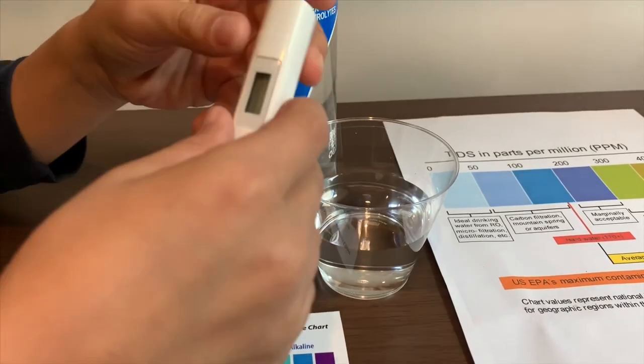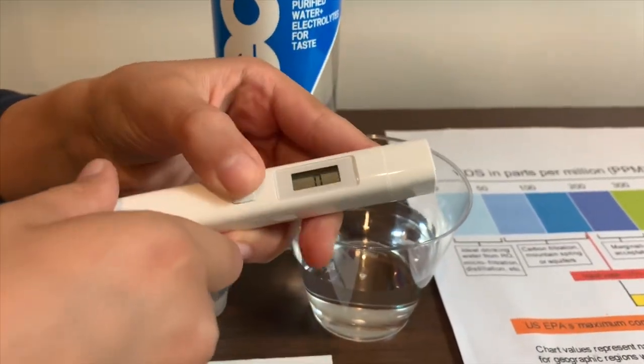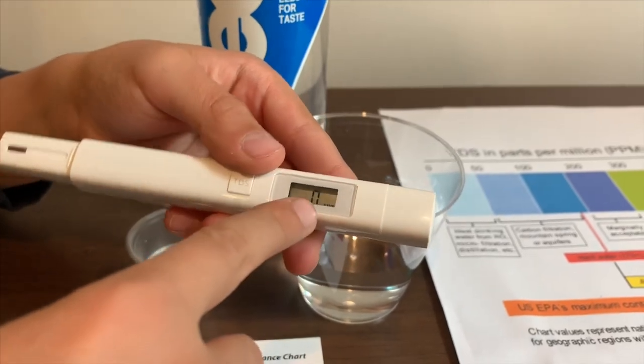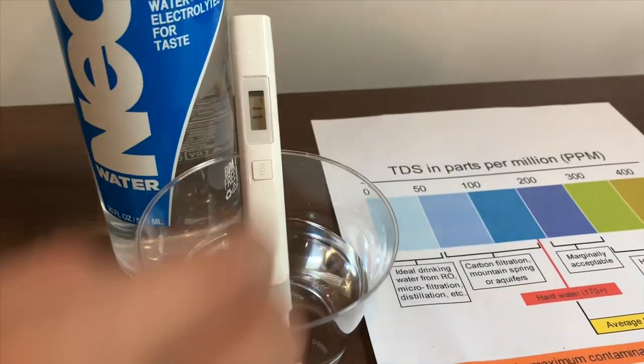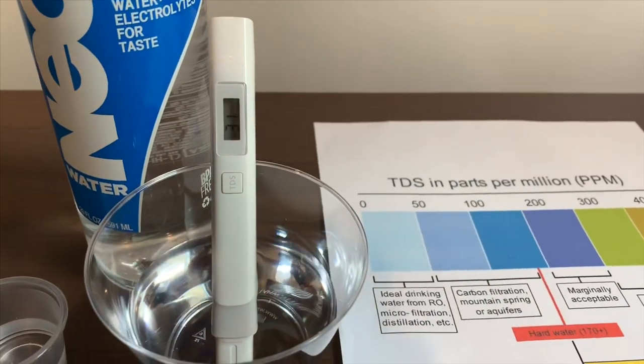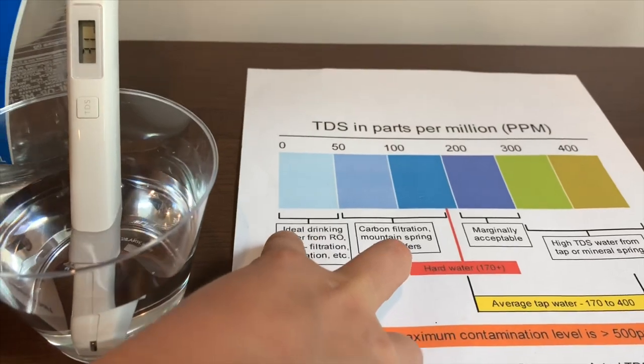If you want to buy this TDS tester, the link is down below. Turn on the TDS tester, make sure it says 0, and let's put it in. That is ideal drinking water.